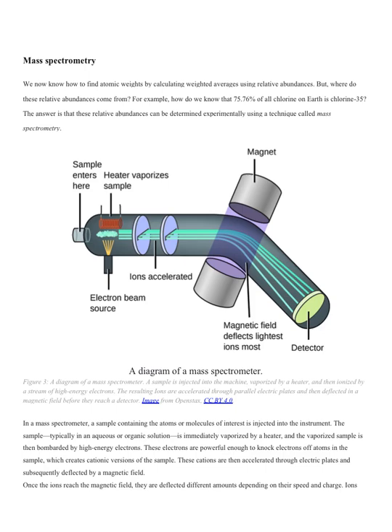Mass spectrometry is an experimental technique in which scientists can determine the number of isotopes that an element has and their relative abundance, utilizing the following technique as you see here. Mass spectrometry is mainly used with elements, and it can be used for other things too, like compounds and such.